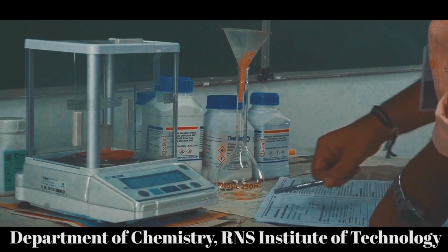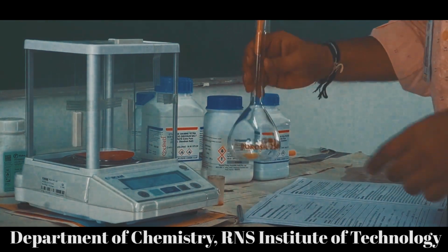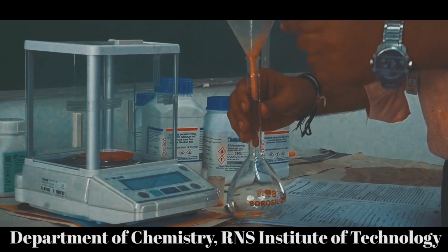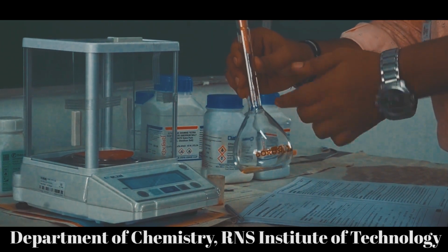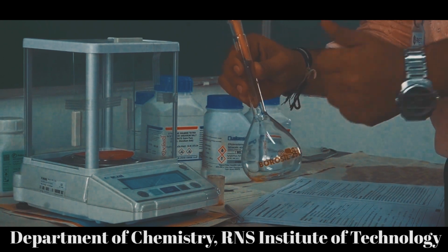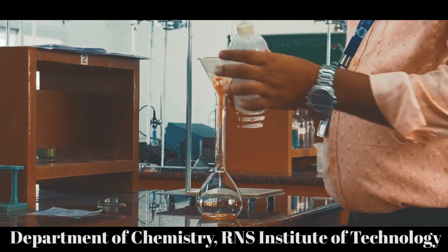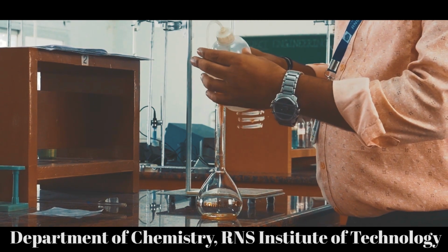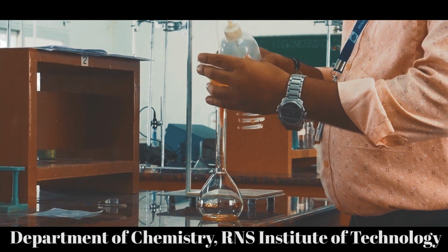and that will be 3.685. Then keep this outside, and then you have to go for adding distilled water through this funnel in the beginning. You have to add distilled water stepwise, and you need to make up the mark. For that, let us go to the table. We need to add distilled water through this funnel for the first 2 to 3 times.